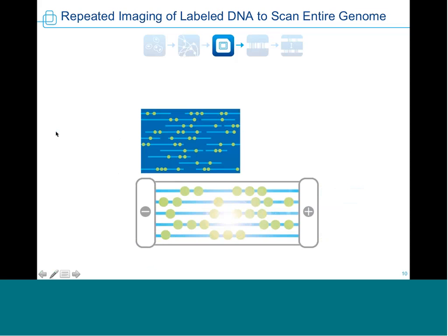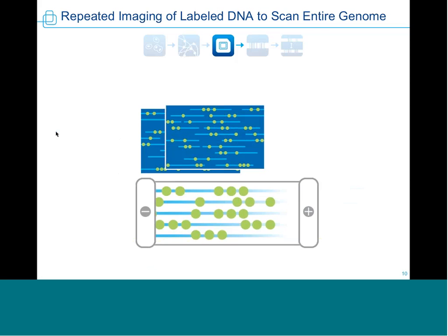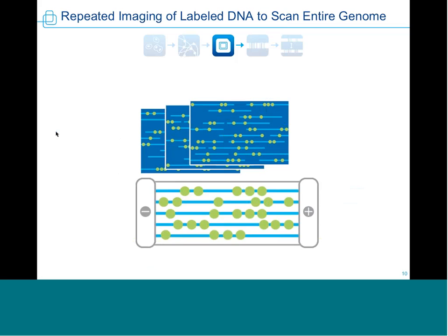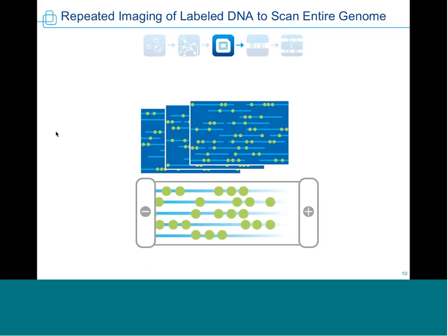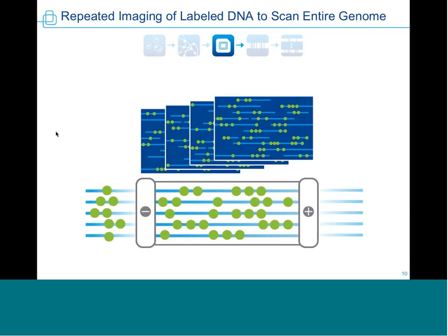So it can either be the way that the capture probes are designed in the technology or just the inherent read lengths of the enzymes that are being used. But as most of the audience probably knows, the longest reads that could ever be contributed in those technologies are towards 500 base pairs.